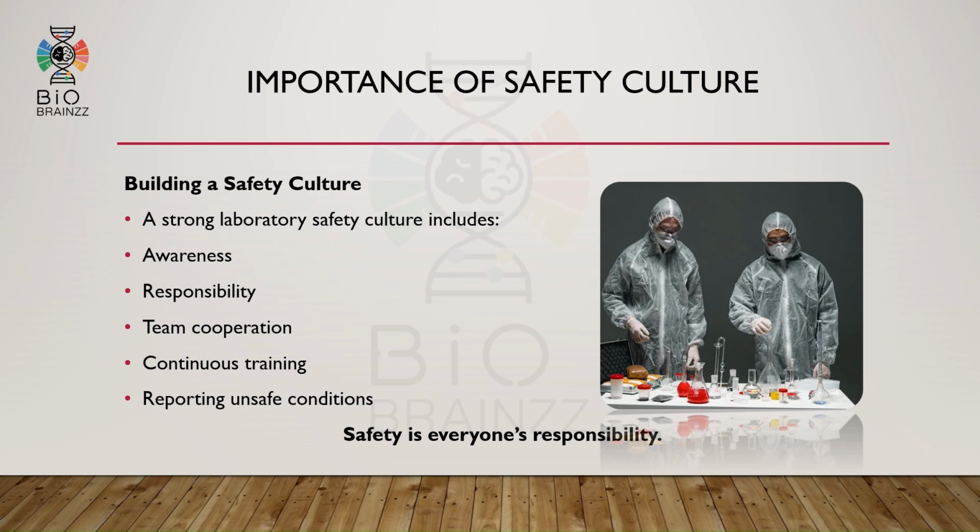Safety culture means creating an environment where every person takes responsibility for safety. A strong safety culture includes awareness, discipline, teamwork, regular training, and reporting unsafe conditions immediately. Safety should not depend only on rules, it should become a habit followed by everyone in the laboratory.